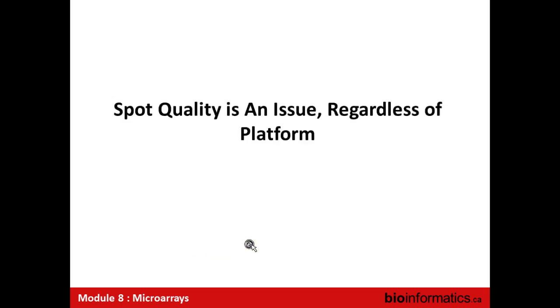So that gives you a kind of feel for the fact that spot quality is fundamentally an issue, regardless of the platform, regardless of the technique. We pretty much never talk about quality, and certainly not at this level when it comes to sequencing studies. Let's just say there is equally a problem with the sequencing data sets that we analyze in terms of quality, and we just don't know how to address it in general.